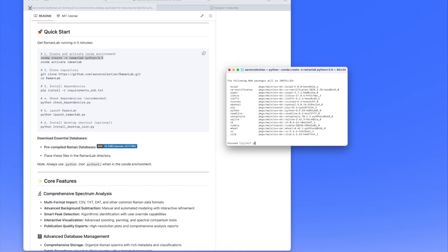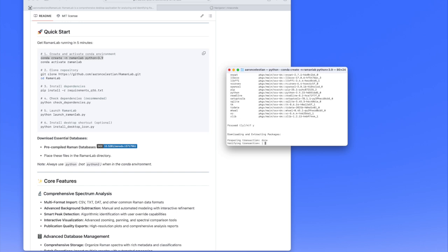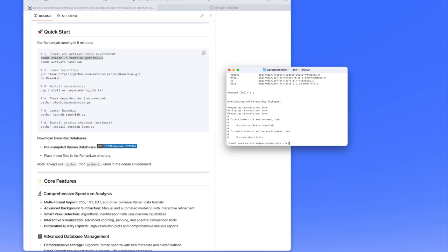It's not essential, but I think it's essential in that this environment is completely separate from the other Python environments. All the packages you install, all the packages you update, things like that, all stay within this environment. So if you're in another environment and you install updates to packages, it won't affect this one. That is actually a good thing that keeps them separate, because sometimes when you update, it can break the software.